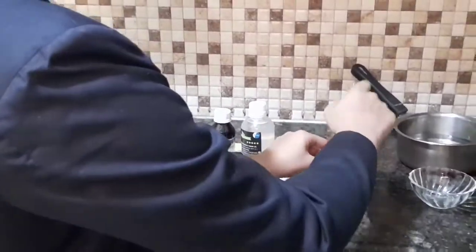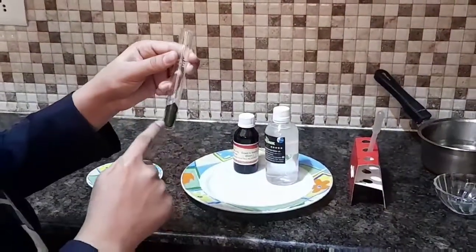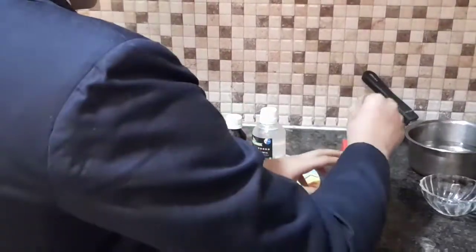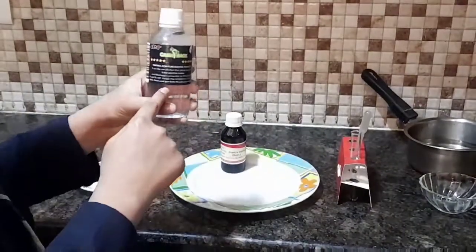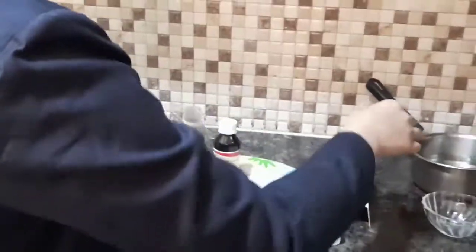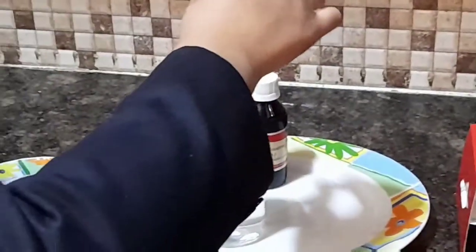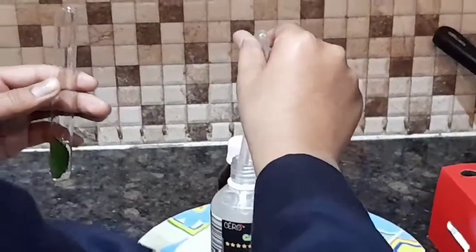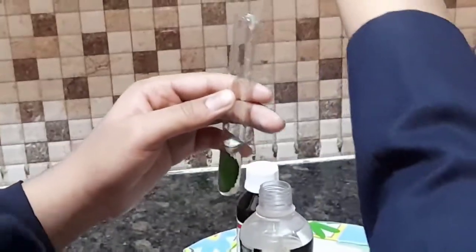To test if leaves contain starch, first we have to take all the chlorophyll out of the leaf so that we can get a better result. So here I have isopropyl alcohol as the spirit to take out the chlorophyll. So now I am going to submerge the leaf in isopropyl alcohol. So now the leaf is submerged in isopropyl alcohol.